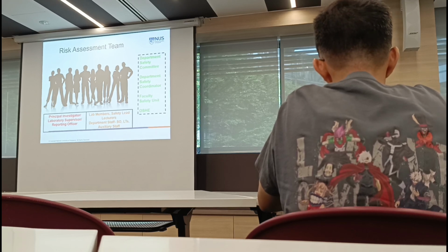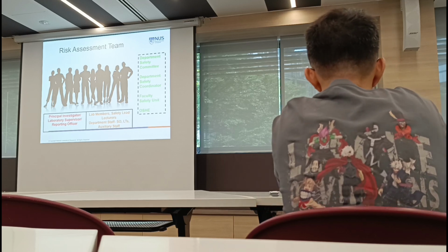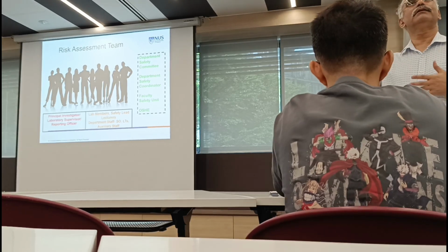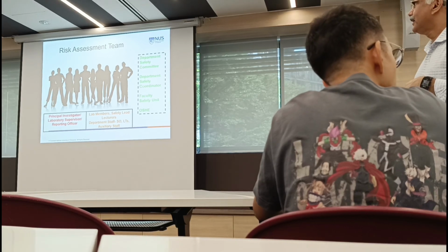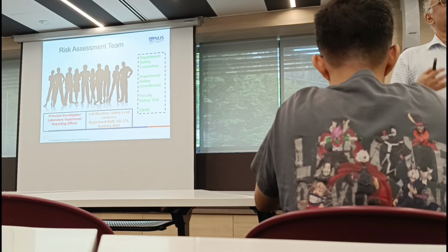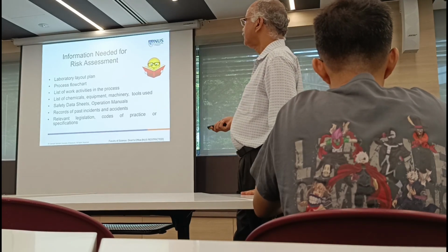And then remember, you are never alone, right? We have a whole setup for safety issues, right? We have a department safety committee. Your supervisor is in charge, but the department safety committee will always be involved when there is a safety issue, right? And there's a coordinator who inspects the lab, etc., the faculty safety unit, OSHE. There is a lot of help you can get if it is something which is difficult to do.